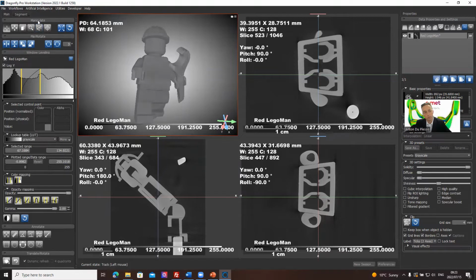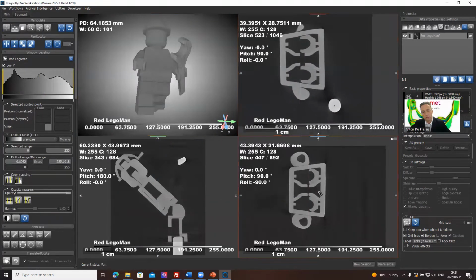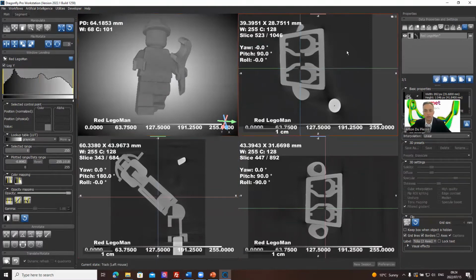Right now, I wanted to start with the first panel, the manipulate tools. So as I said before in the introductory video, some shortcuts are left and right mouse button and drag to move around the object in any window. So it's important to realize that the window that is active has a colored line around it.